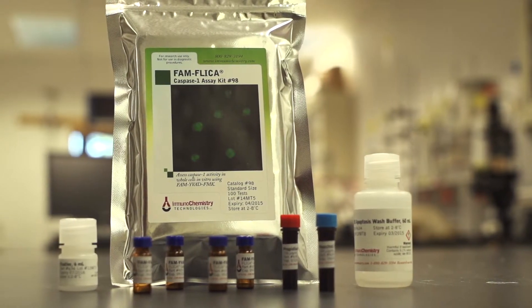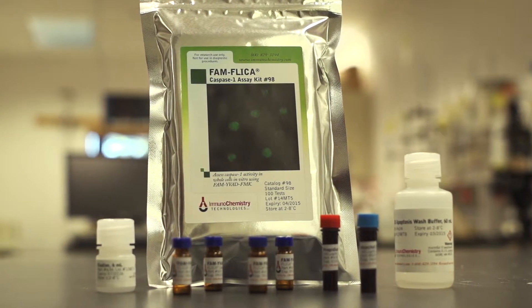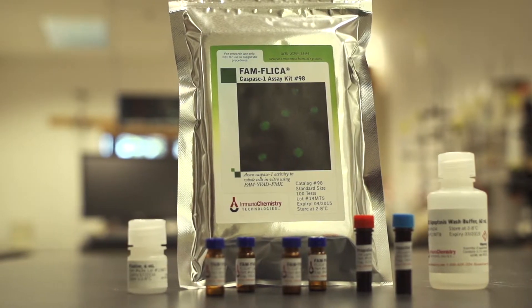Immunochemistry Technologies' easy-to-use FLICA kits assess cell death by detecting apoptosis in whole living cells in vitro.